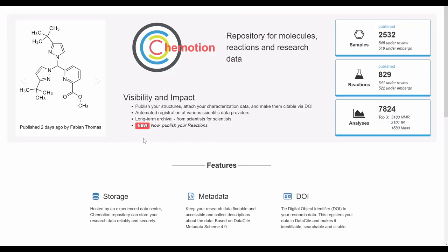The repository homepage shows, among other things, recently published samples and reactions, as well as the number of samples, reactions, and analytical datasets published so far.